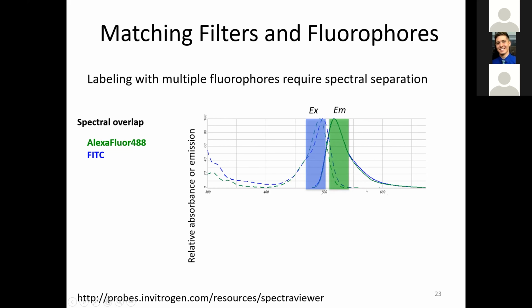When we select fluorophores, we want to bear in mind the filter sets that we have on our microscopes. In our case, well, not so much in the case of the 980, where the emission is variable in that system. But in anything that uses filters for emission discrimination, the specs of those emission filters are set, and there's not a whole lot we can do to change those. So we want to make sure that we are very carefully selecting our fluorophores.